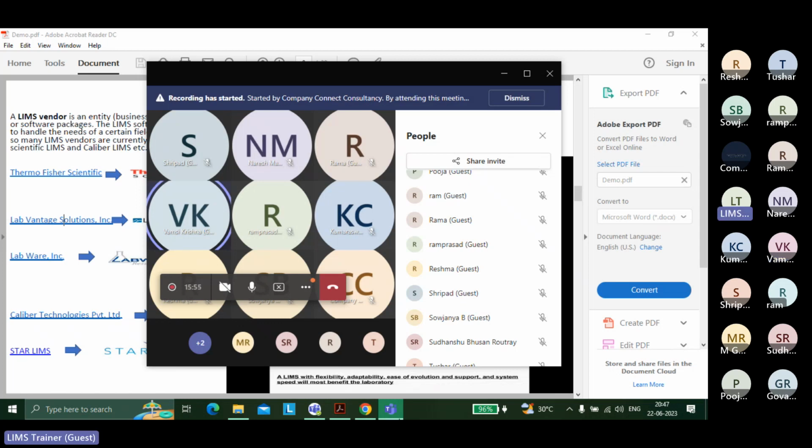But I'm trying to tell you from a developer perspective, and you are telling from a tester perspective. I agree. But my point is, for example, where scripting comes in: you gave me a requirement that I am doing a content uniformity stage test, and I have two components. If this fails, I need stage 2. If this fails, I need stage 3. Then I need some development, some customization, some code, to set certain limits. If this is out of my limit, these two components will come. If this is out of this limit, these three components will come. You mean to say that in the existing shared backend, you will make some configuration settings for that requirement. Yes.